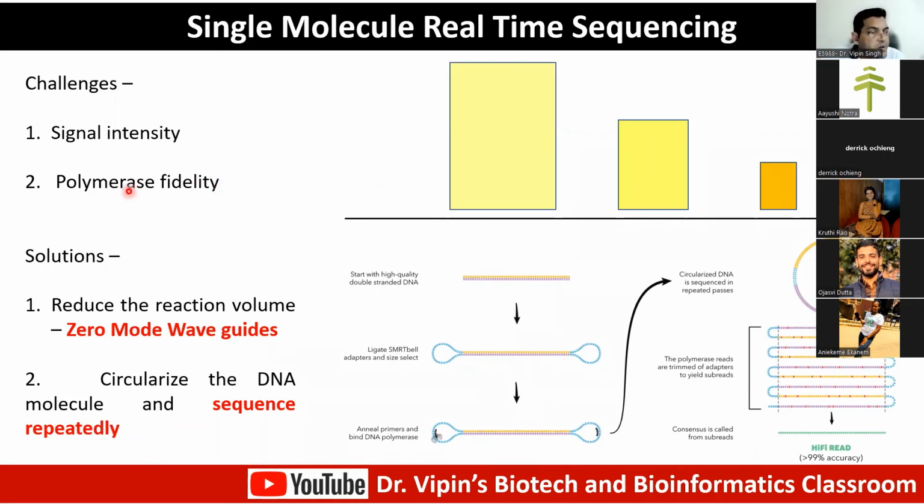Then the second important problem is polymerase fidelity. You know that polymerase is not perfect. While you're sequencing, it may add a non-complementary nucleotide as well. If you have a single molecule, then once misincorporation happens, this cannot be corrected. So what they do here is circularize the template that you want to sequence. You circularize it by adding adapters at both ends, and then you sequence it multiple times like a rolling circle model. So the polymerase keeps sequencing it multiple times.